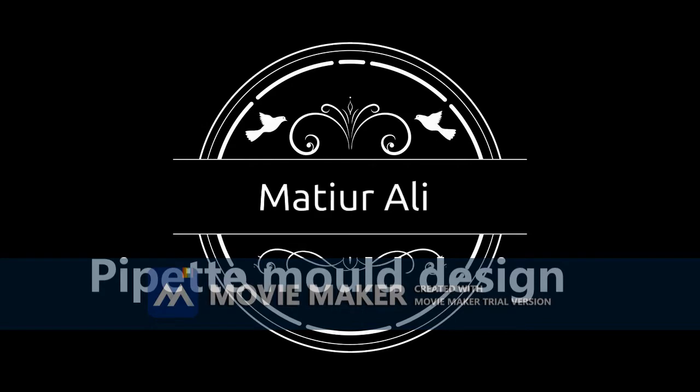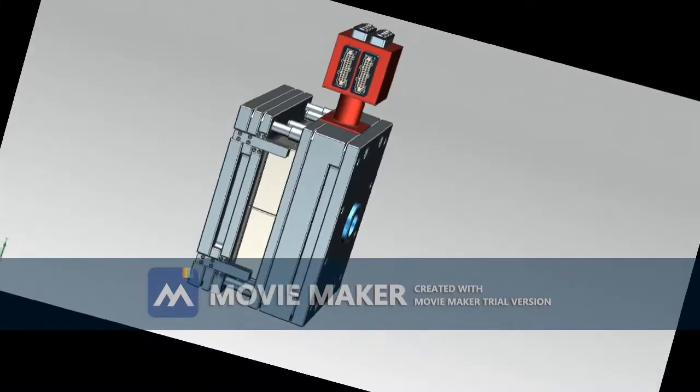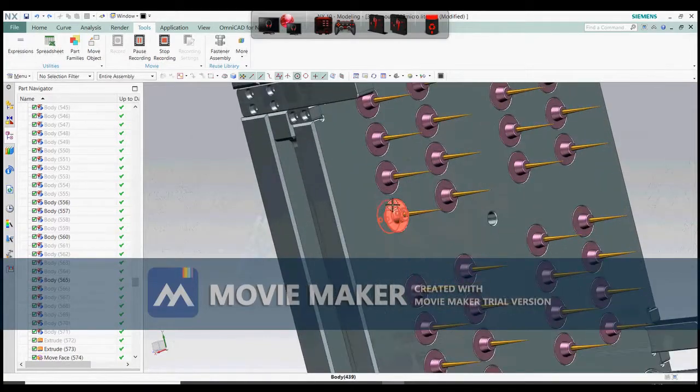The PBS pipette tip mold, integrated with the PBS hot runner system, can be controlled both thermally and mechanically. It features large cooling capacity and high precision for better production.